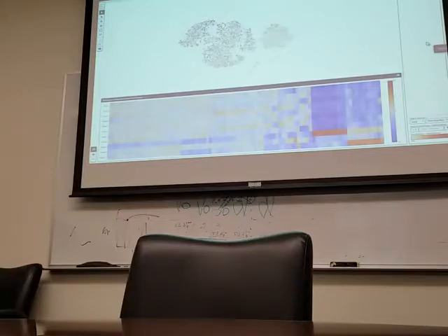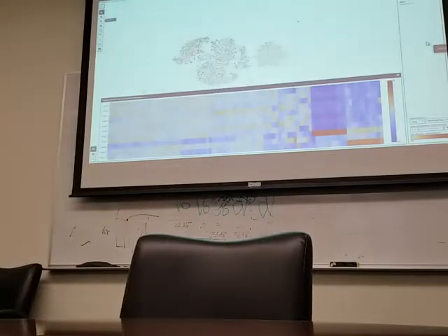Yeah, you need a vector or something. You need like an eigenvector. This, or this, and that makes B cells. Yeah. But actually, you know what? We're not that interested in this that much because we already know the answer. Yeah, but you could probably throw out that line at the top. Yeah. Right. In the cluster 9.